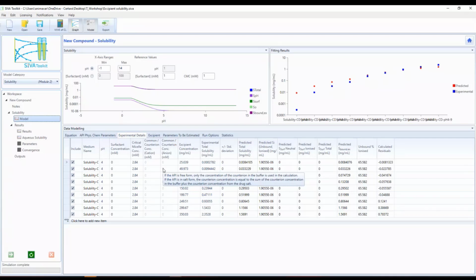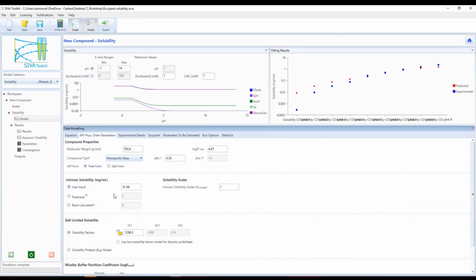So is there any particular question? Yes, Ali, we got some questions in the chat box. So Florent was asking which intrinsic solubility do we need to input? Is it the solubility in water? Basically, intrinsic solubility is the free unionized solubility, or unbound unionized solubility. So solubility in water, it depends on the compound. You may get ionization, right? So you have to factor out the ionized values and then only input the unbound unionized solubility here.